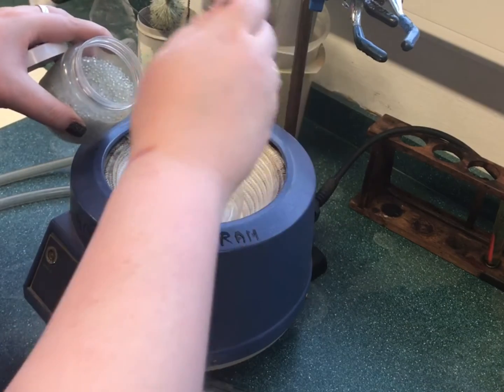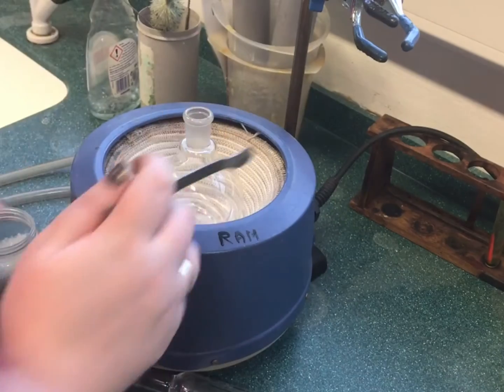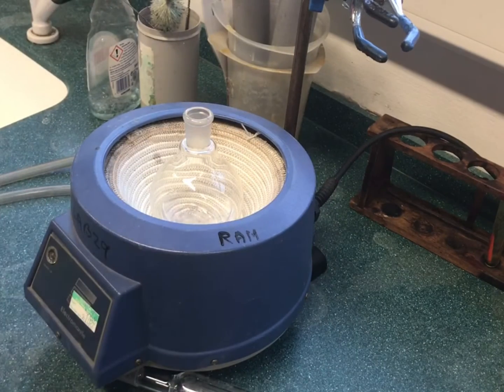Antibumping granules cannot be reused. Once the reaction mixture has cooled, the porous antibumping granules will absorb some of the mixture and will not be able to be used again. A condenser is attached to the flask.